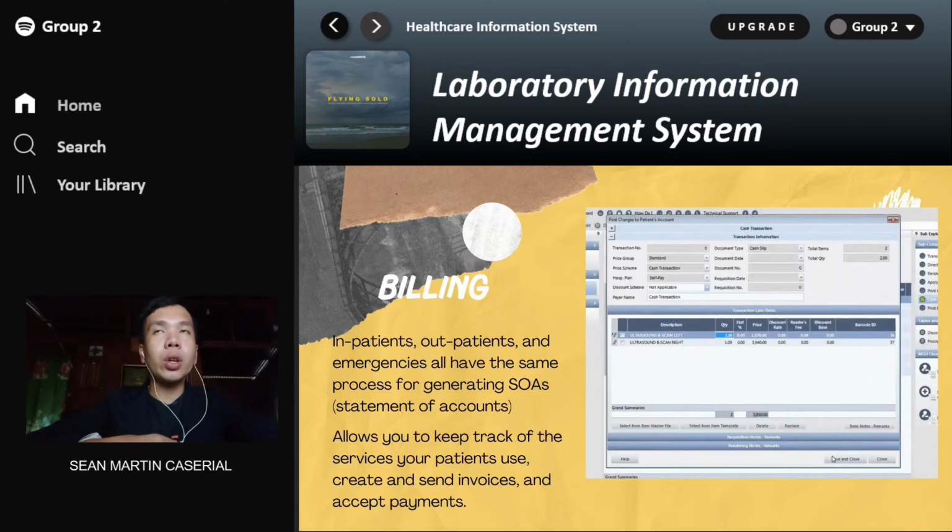So billing, we all hear or we all heard this word billing. So when we say billing, money, money. So this is inpatients and outpatients and emergencies all have the same processes for generating the statement of accounts, allows you to keep track of the services your patients use, create and send invoices, and accept payments.